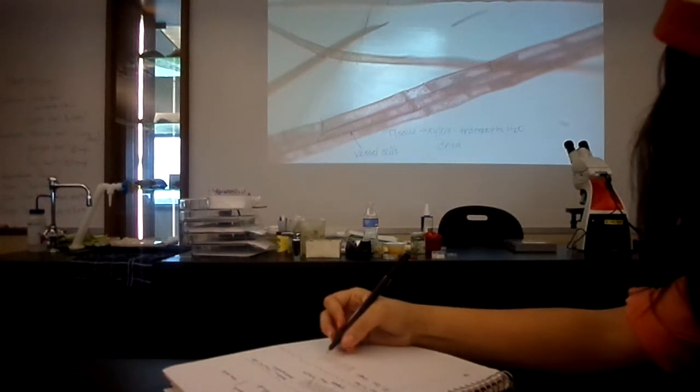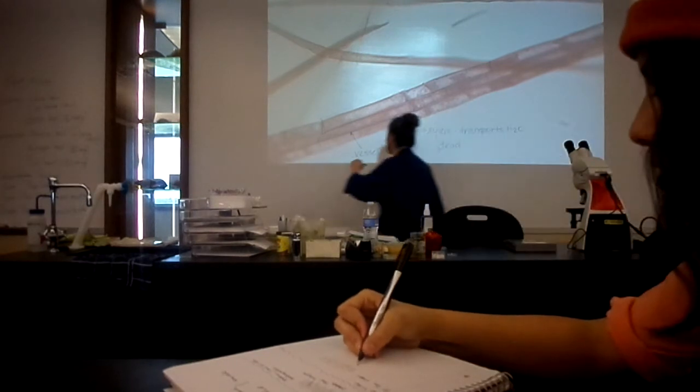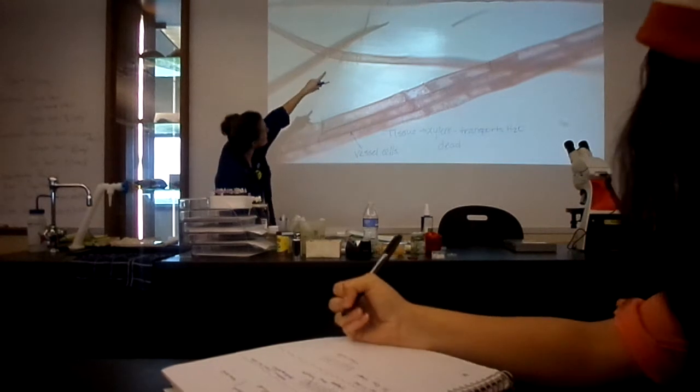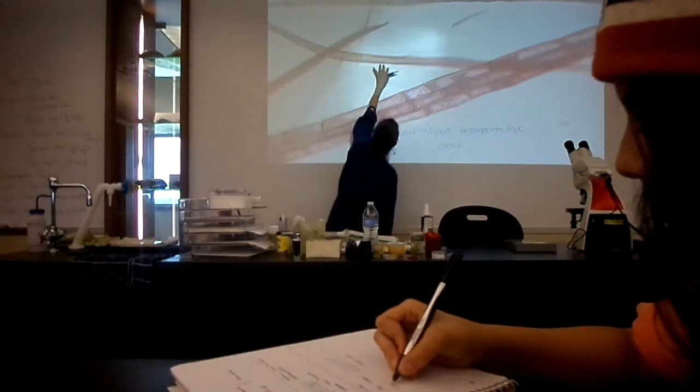Are those dots? Yes, I'm going to tell you what that means. Yes, there's dots inside of them, okay? All right, I want you to look at the three cells that are kind of up here at the very top, right here, and right here.